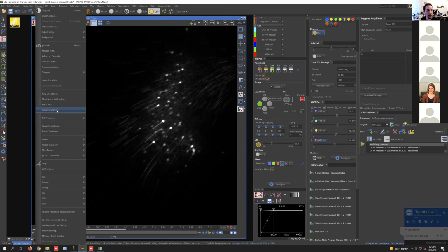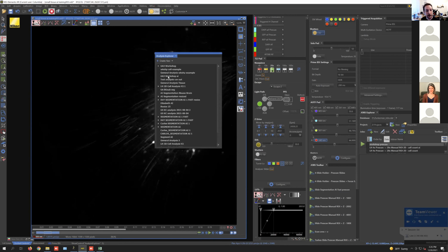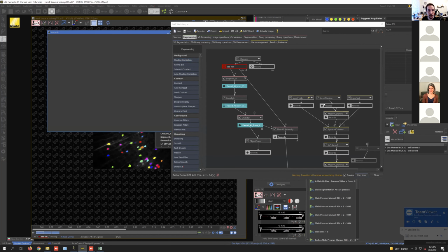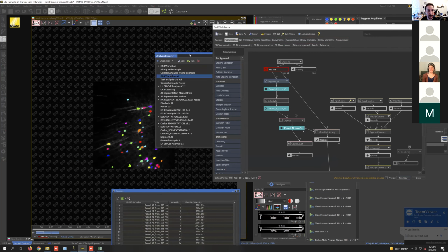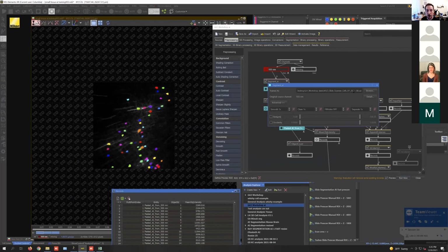So if I go to the Analysis Explorer, here are the jobs that we have available on the microscope. And this is one that I made to sort of demonstrate analyzing these neurons. So if I click edit, we've got our same sort of CSV stuff over here, so just don't worry about that. What I'm doing is I've got the 555 channel. I have our segment AI that we looked at. And actually, I just want to point out some things here so that you have a good chance of using this well. I'm using the one we already have trained for dealing with this data.